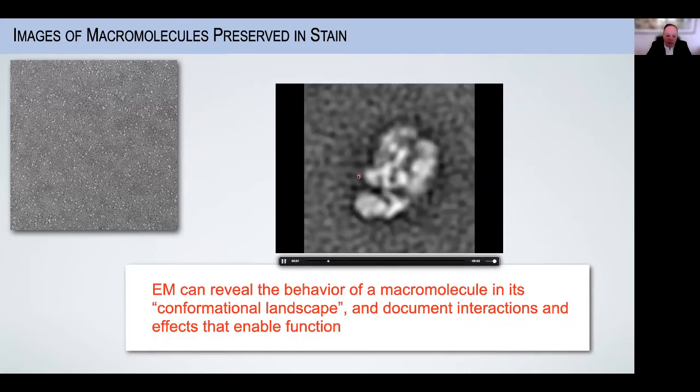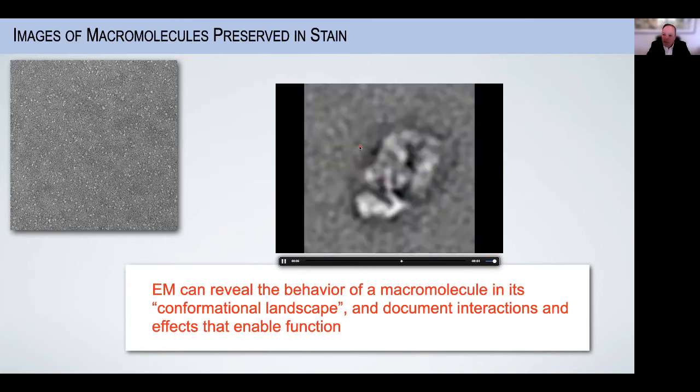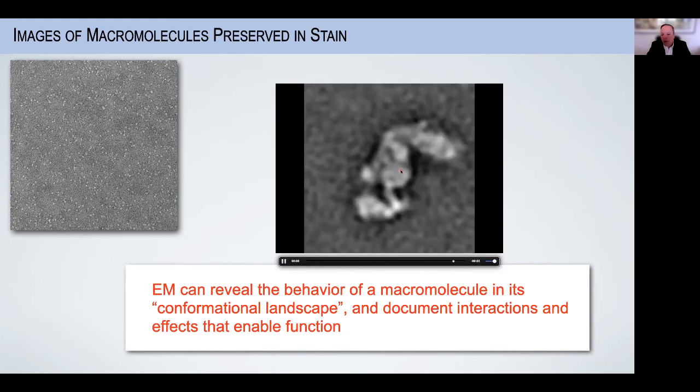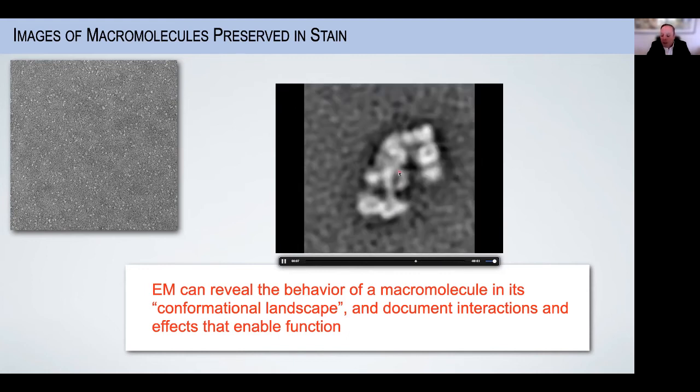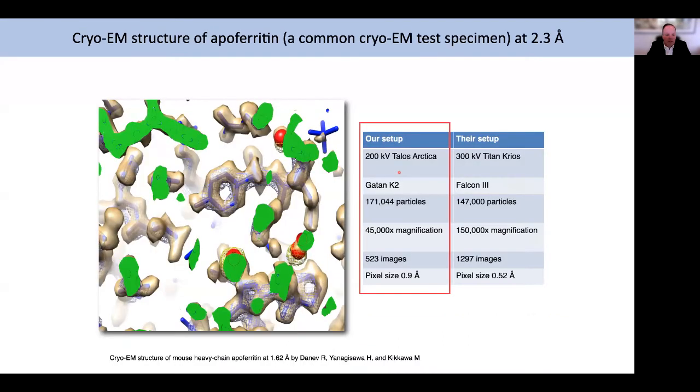So even at this early stage, EM can be used to really provide a surprising amount of information at low resolution about large macromolecular complexes from very limited amounts of material, and that will become clear in one of the next slides.